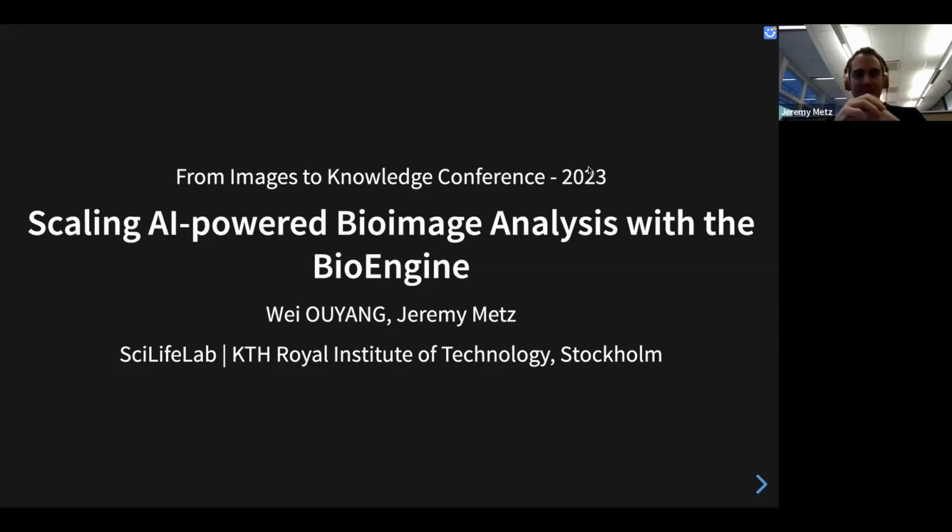Sure. Hi, Wei, and hello, everyone. As Wei said, I've just joined. I've been in the group for a couple of weeks now, and my background is as a computational image analyst. I'm really excited to have started working with Wei on this really cool project called the BioEngine and the Bioimage IO community, which you're going to learn more about today.